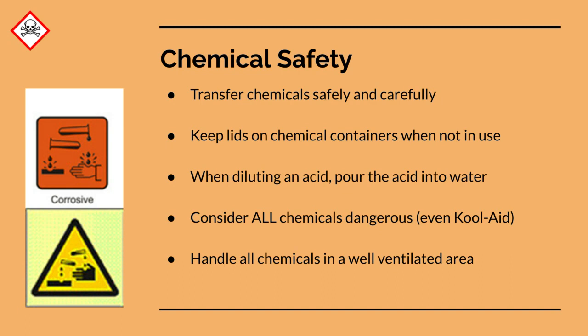Okay, so meaning if you've got a little bit of acid and a whole lot of water, that water is pretty much going to surround that acid and keep you safe, rather than the other way around. There are some acids that are quite volatile when you add water to them, meaning that they boil and can start spurting acid everywhere if you decide to add the water to the acid. So it's always, always, always best to add the acid to the water. Okay.